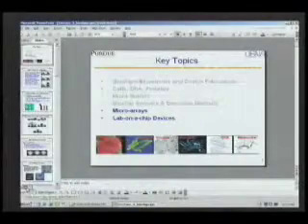which is really called Lecture 3. But we have really taken about 5 lectures to cover these. Okay, so this is the last one. This is the last set of slides. And I'll now move to this area of microarrays, and also tie that to optical sensing.